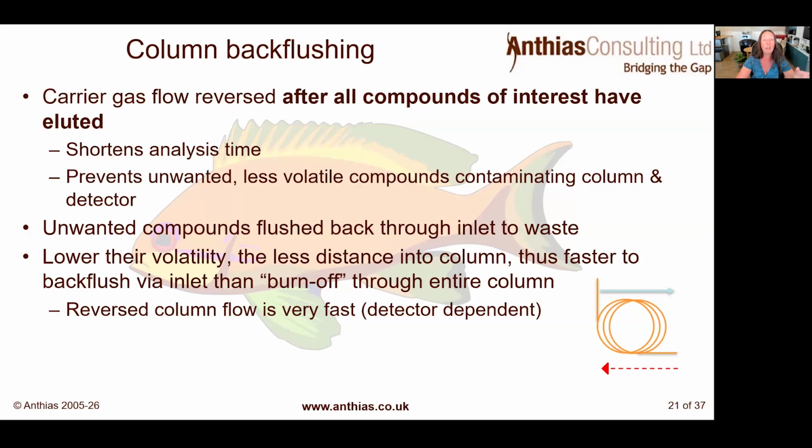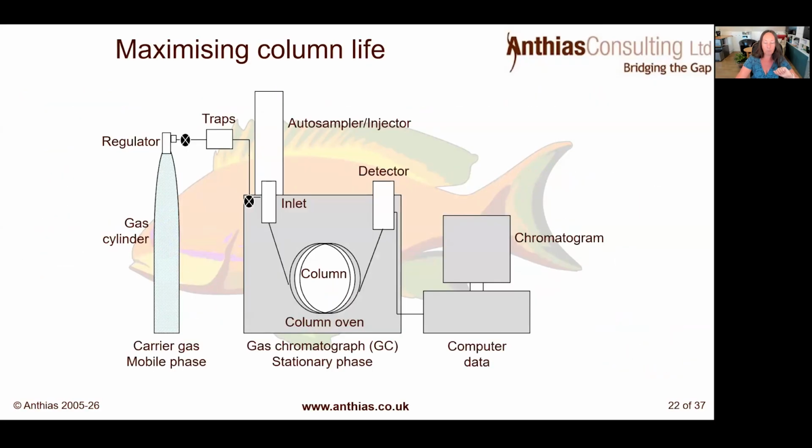But if you can control it through optimizing your inlet temperature and regularly changing that liner, then guard columns and back flushing might not be necessary. So maximizing basically your column lifetime, think about it then.